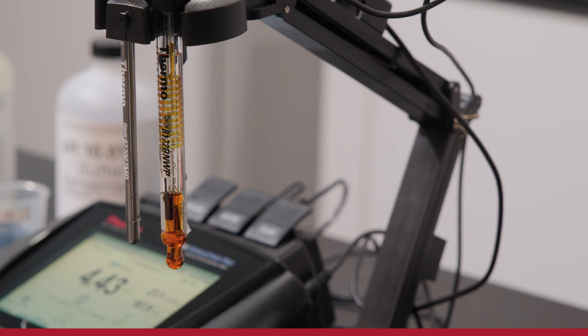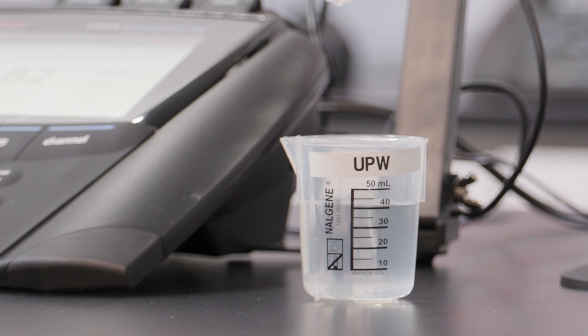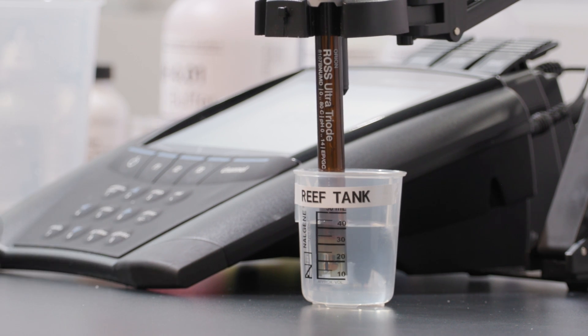Ion concentration can significantly influence pH readings because pH is a measurement of hydrogen ion activity. The levels of all ions in a sample, known as ionic strength, can affect hydrogen ion activity and therefore pH readings. Most electrodes are designed for mid-range ionic strength samples, which makes it challenging to get accurate readings for low ionic strength samples like potable or ultra-pure water, and high ionic strength samples like brines or seawater. Issues may include drift in readings and bias due to large junction potentials.